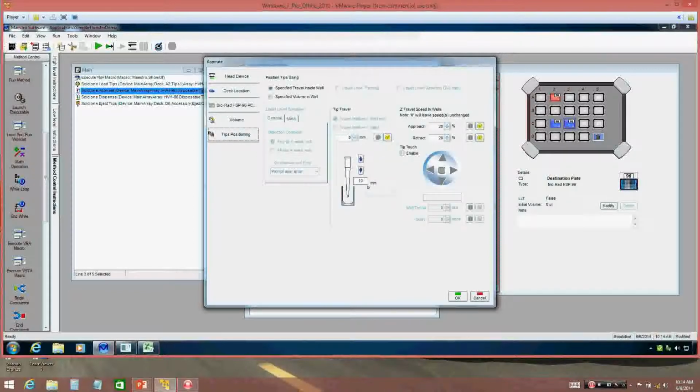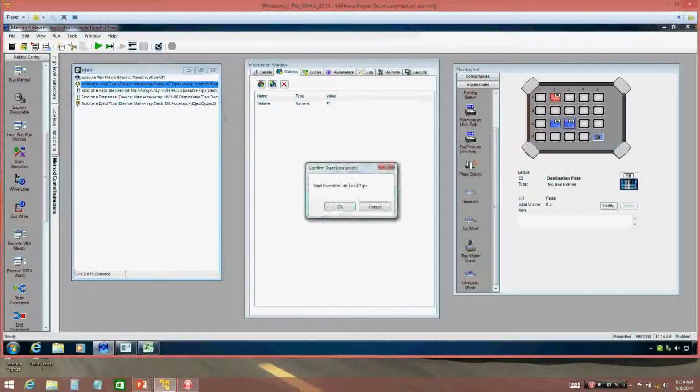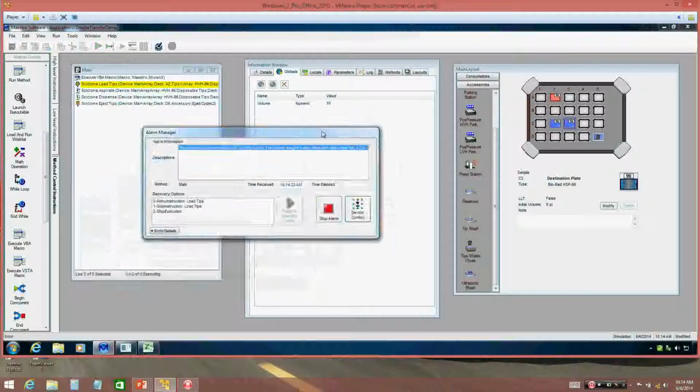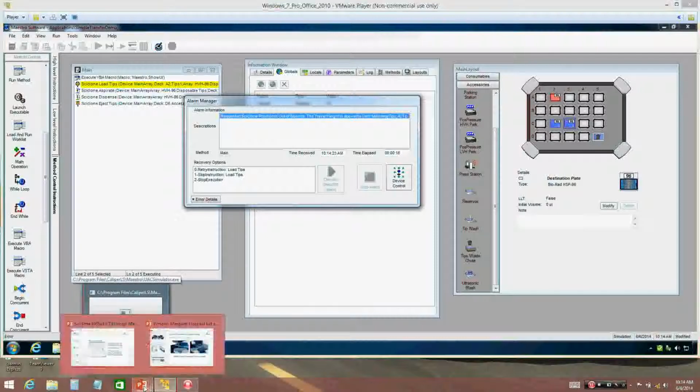Okay, let's see. I actually want to bring up that error screen that you saw, because there's something that we have in the software called error recovery. And I know right now I'm just bringing one up to show you some of the options. If you notice on the instrument, there are doors here.